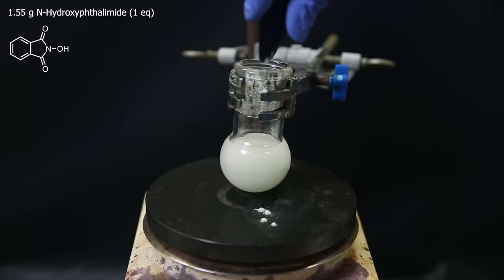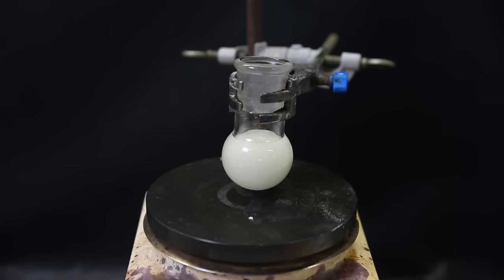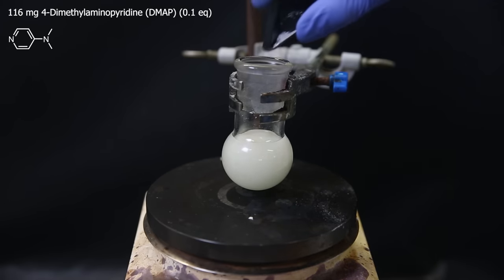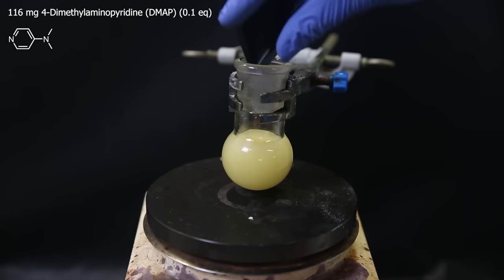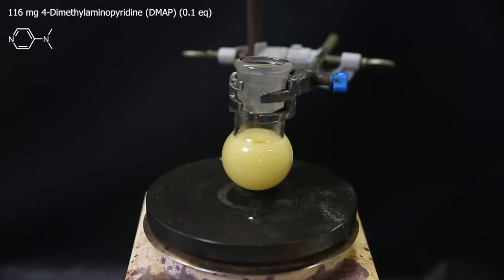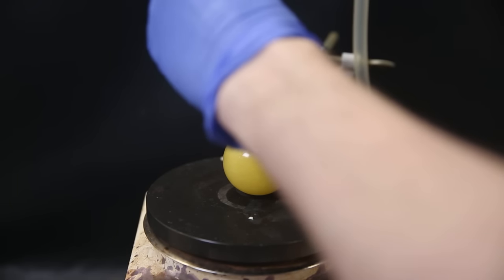I spill some, but it's okay. Then I just move on. Then as the catalyst, I add 116 mg of 4-dimethylaminopyridine, or DMAP for short. It reacts immediately to form a salt with the acid and perhaps produces some intermediate products, causing it to turn yellow.